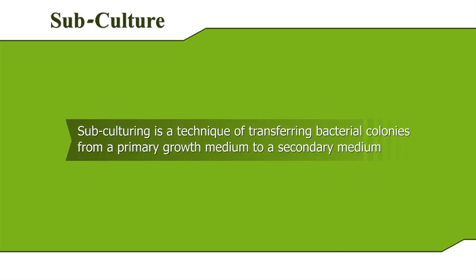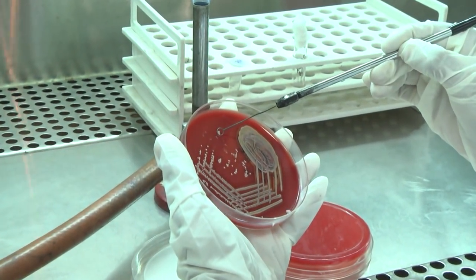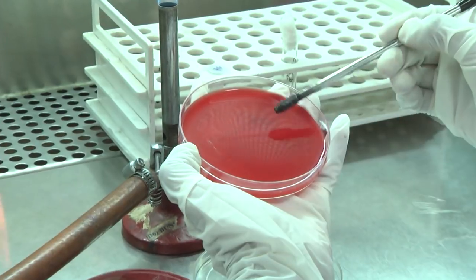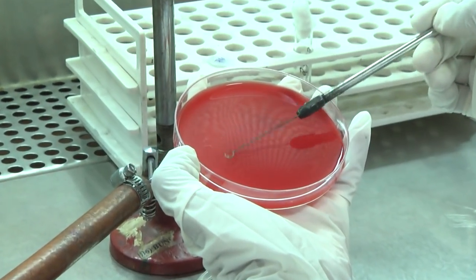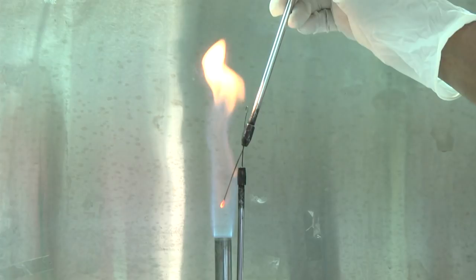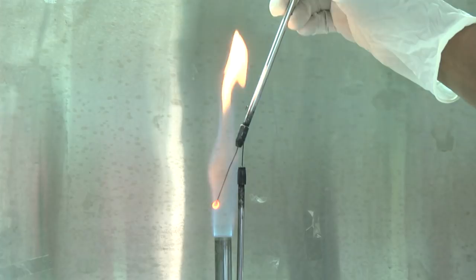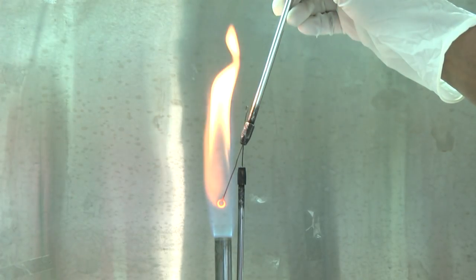Subculturing is basically a technique of transferring bacterial colonies from a primary growth medium to a secondary medium. Take a sterile loop and load it with a portion of an isolated colony on the primary medium. Transfer it to a suitable medium by the streak method described earlier. When making transfers during subcultures, it is advantageous to flame the loop between each set of streaks, which avoids over-inoculation and ensures the growth of isolated colonies.